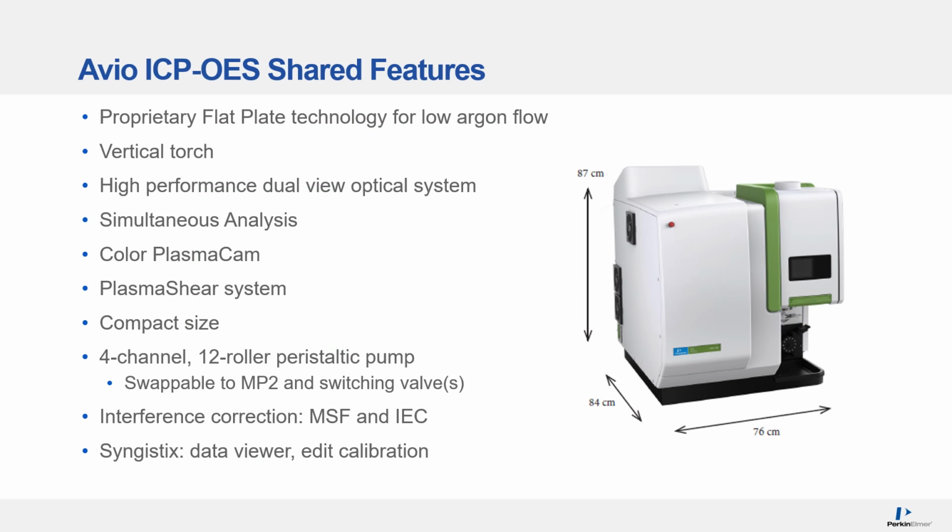The two Avio ICP-OES platforms are built using shared features. We're going to talk about the proprietary flat plate technology, the dual view optics, and PlasmaShear gas system.